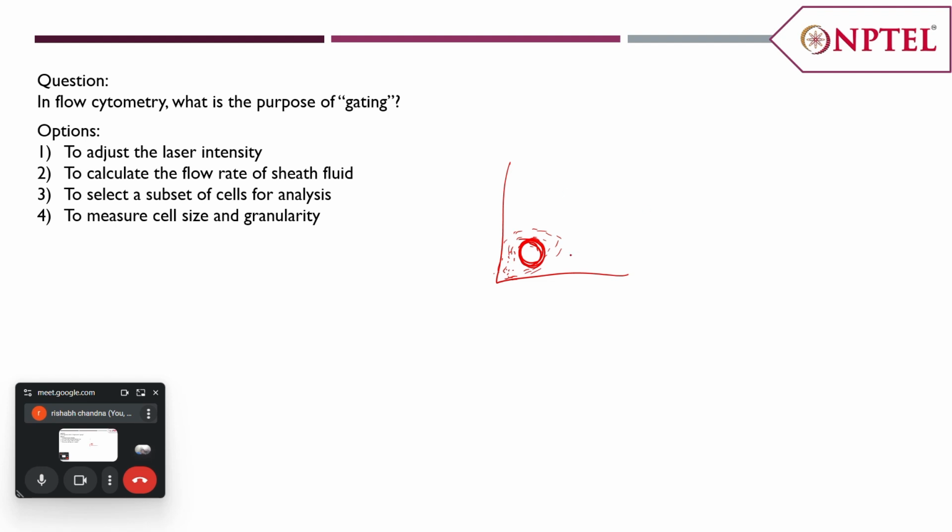Now you have to check further properties from these viable cells, so you get this particular population and you use this for further analysis. The rest of the analysis that will be done will be from this particular population of cells. So we have to separate the cells based upon their viability or non-viability that has been chosen for an example, and in other cases it can be used for different other properties.